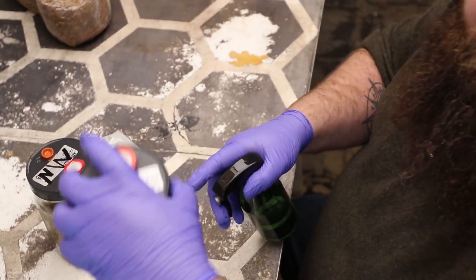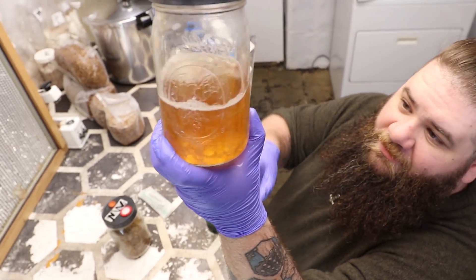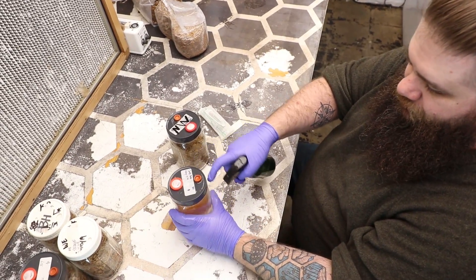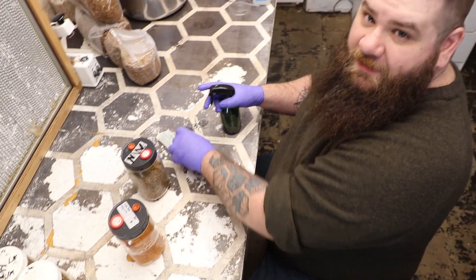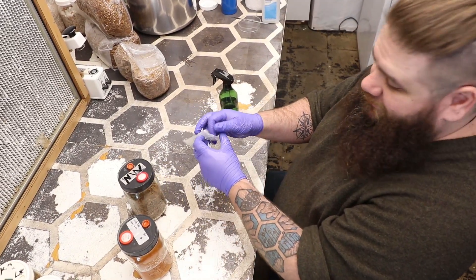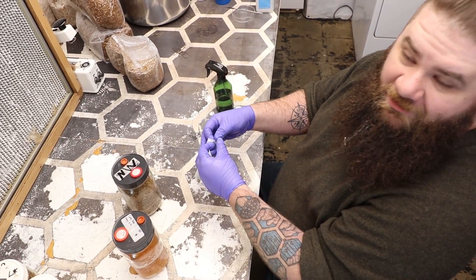So we take our liquid culture — it's been stirred up, you can see it moving around there. We're going to sanitize it, especially the self-healing injector port. I find that the easiest way to make grain masters is to do it with liquid culture. It takes about a minute total of your time.